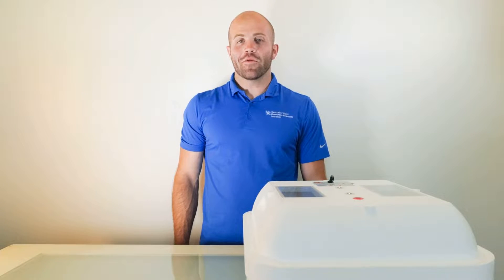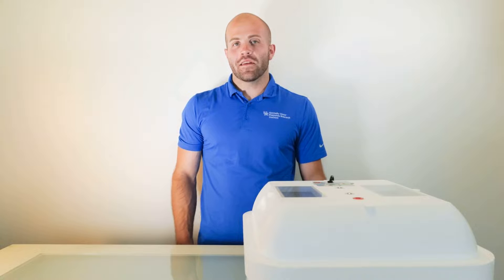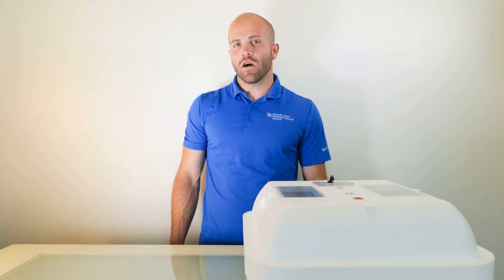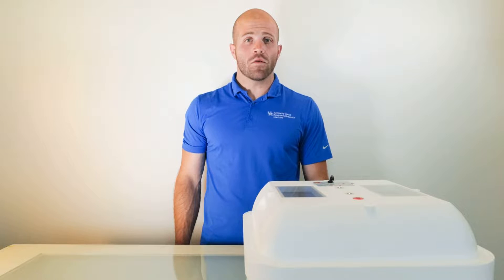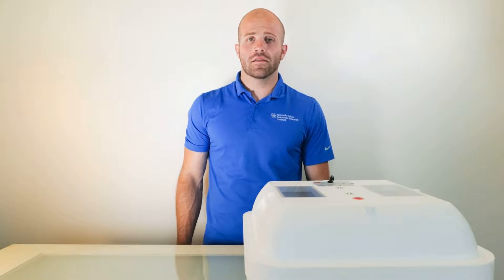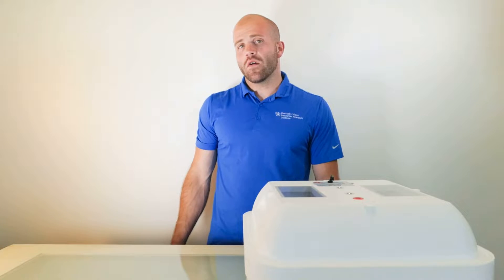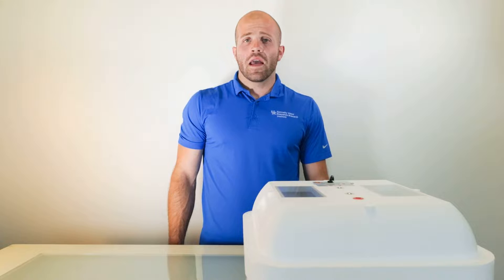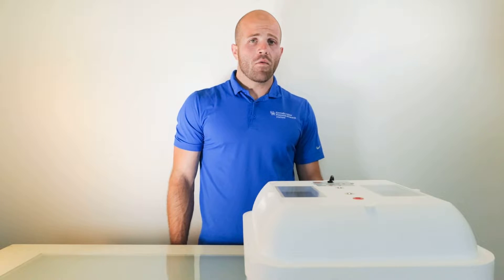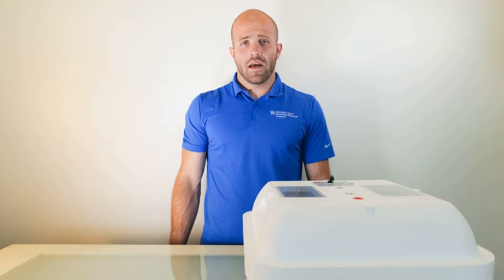Hi everyone, I'm Adam from KWRI. Today we'll be talking about the technique used by the Kentucky Watershed WATCH volunteers to determine the number of E. coli and coliform colonies in a water sample using the R-card test method from Roth Biosciences. By the end of this video, you'll have all the information you need to collect a water sample and determine the E. coli concentration using the R-card test method.